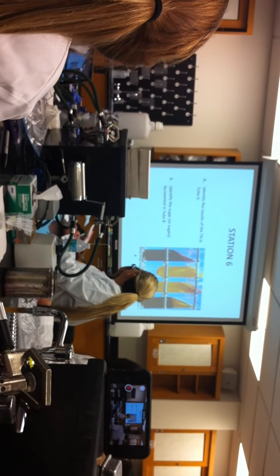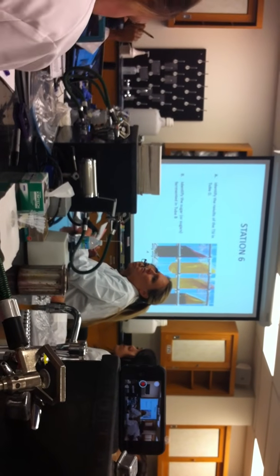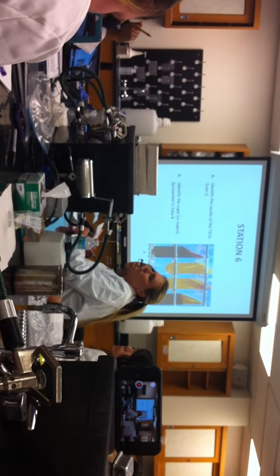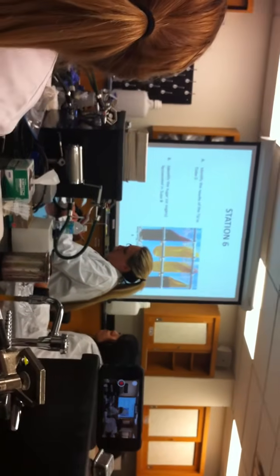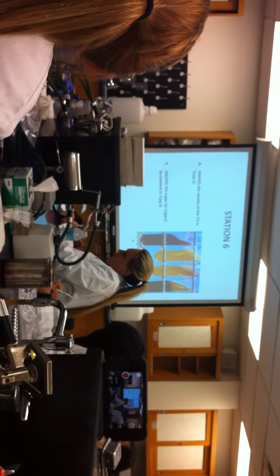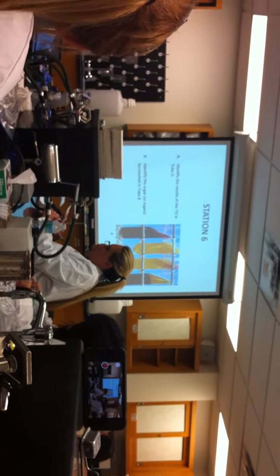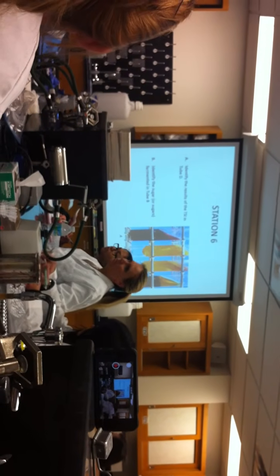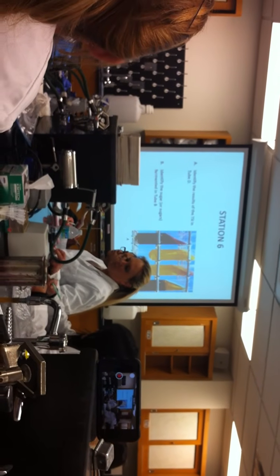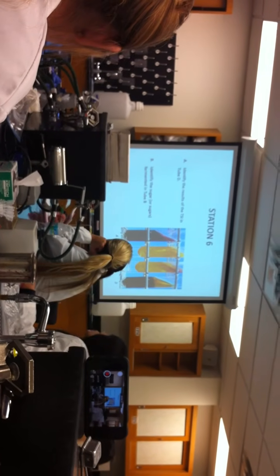Confused on the, so it's just always, the butt is always disaccharides? No, the butt is always glucose. It's always a single sugar. Every single time. All four of those have glucose at the bottom? Absolutely. And then all four have disaccharides at the top? Yes. They're made in parts actually. So you make the butt first, and then you make the slant after.